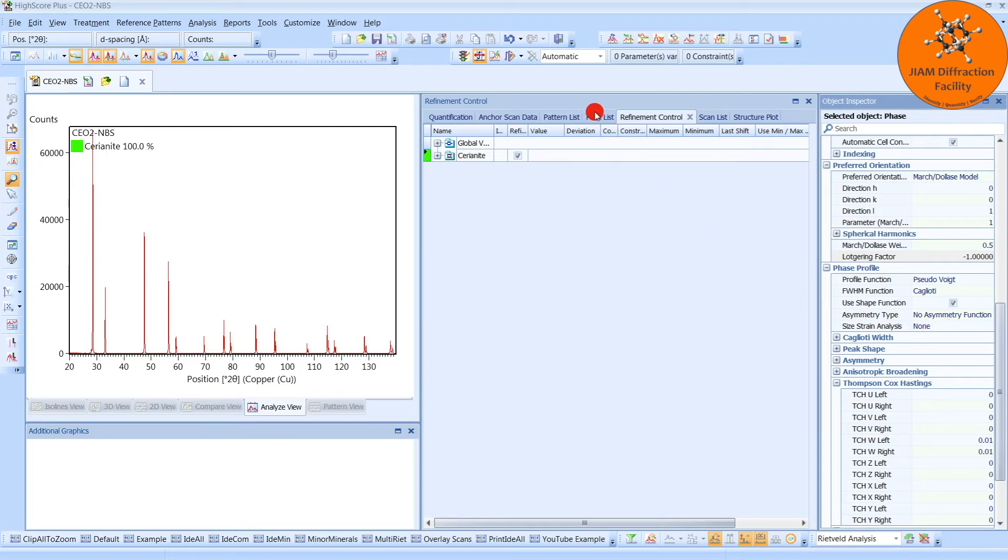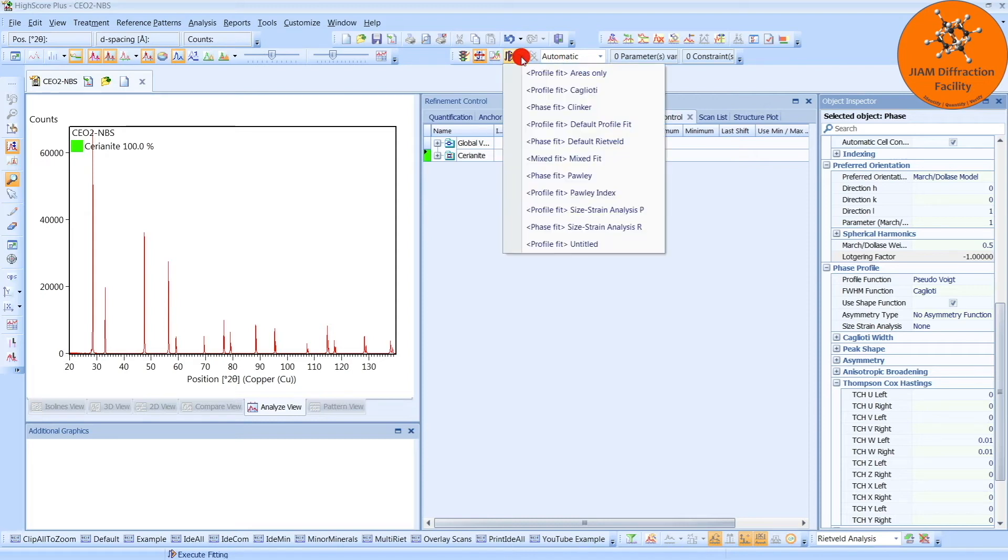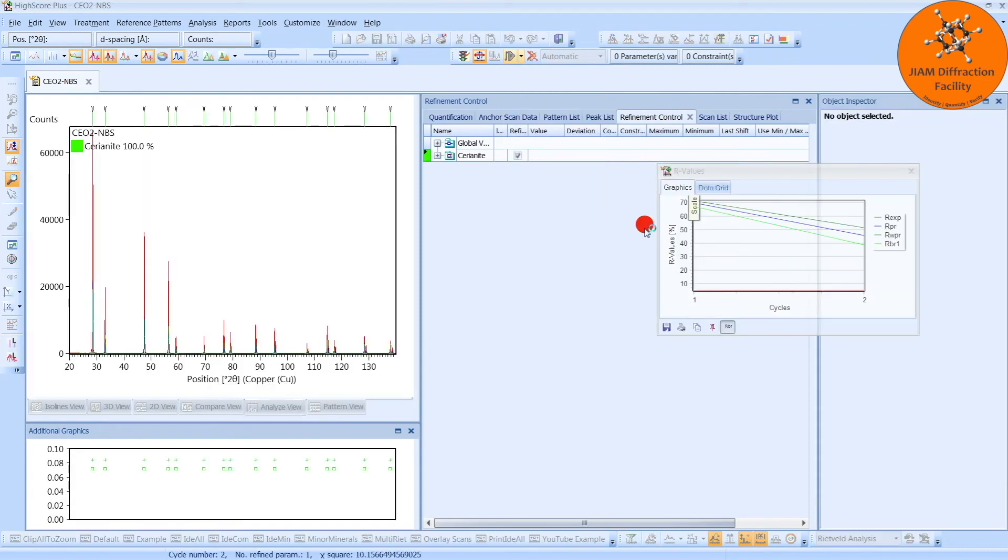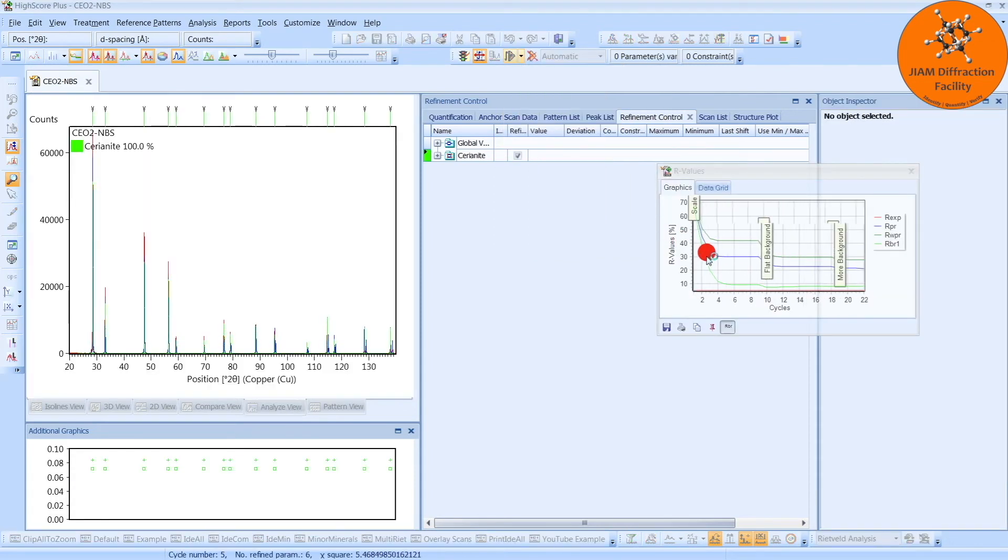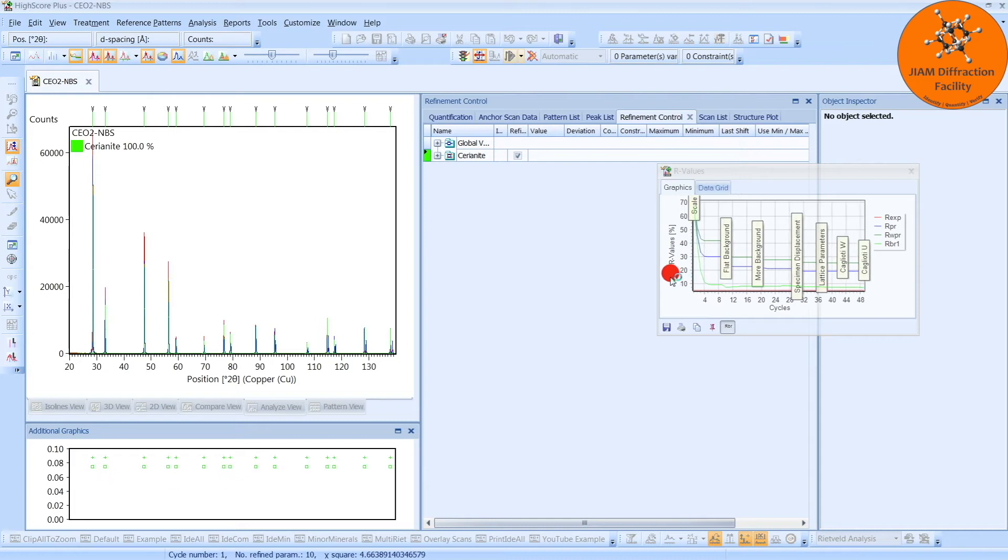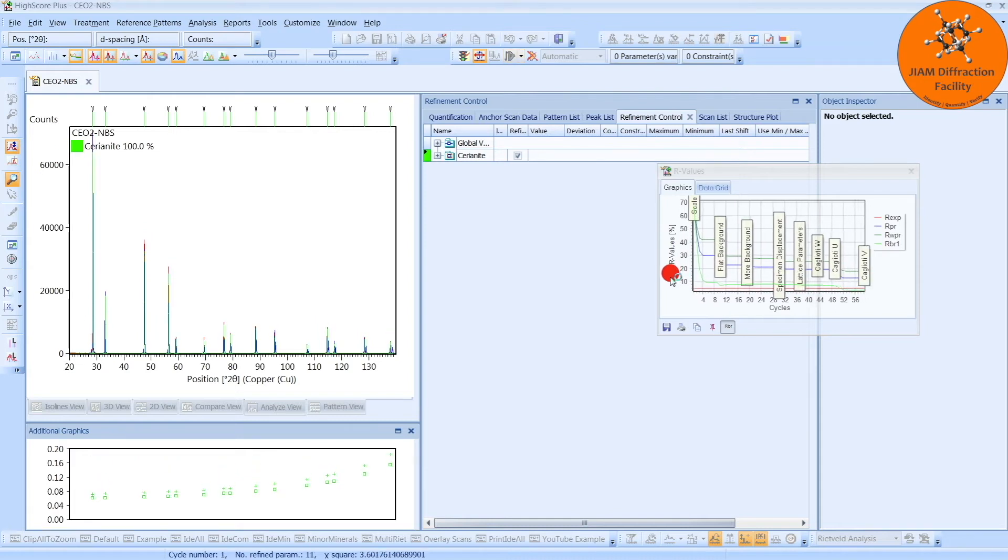and in Automatic Mode, click this button, and perform a Size Strain Analysis R Phase Fit. Here you can see that it is going through the different steps, so we will just wait for that to complete.